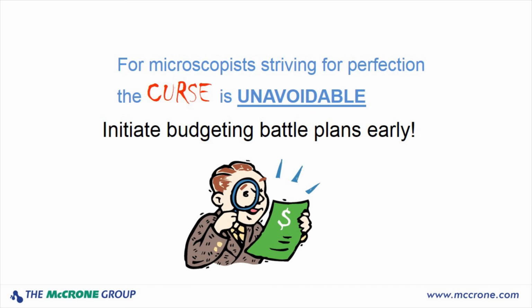So for the microscopists out there that are really striving for perfection, this curse of lighting is absolutely unavoidable. And it's going to be costly. And you're going to have to initiate these budgeting battle plans really early to convince your management that this stuff is really going to be necessary. So I wish you good luck, and thank you for attending.